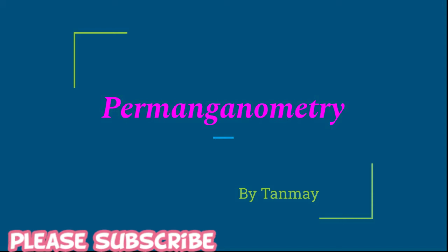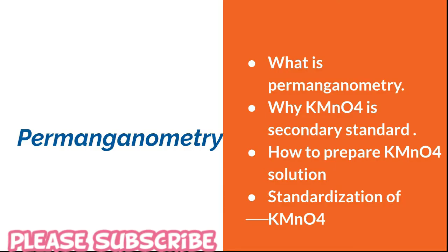So without wasting your time, let's start. I have divided my class into 4 sections. First of all, we will know what is permanganometry. Then we will discuss why KMnO4 is called a secondary standard solution, and then we will know how to prepare KMnO4 solution, and finally we will discuss how to standardize KMnO4 solution.